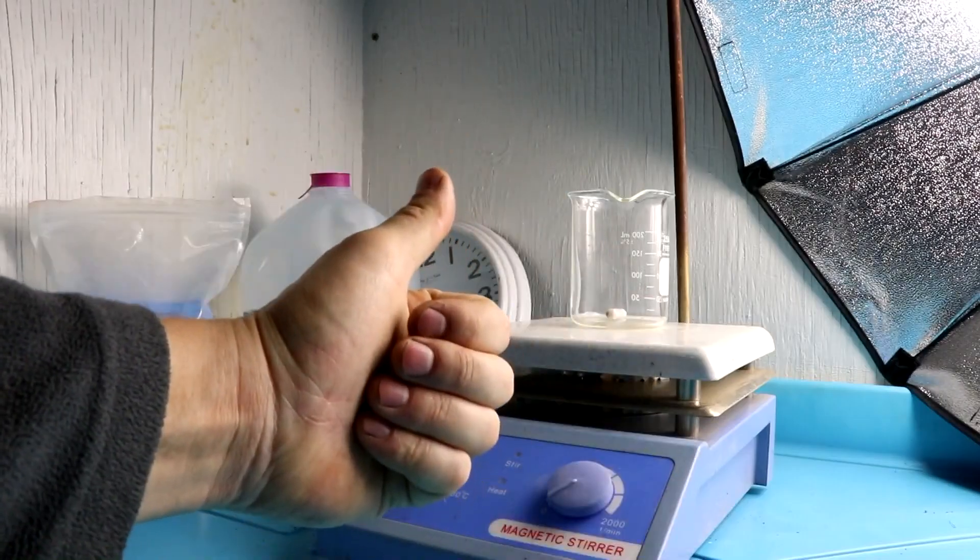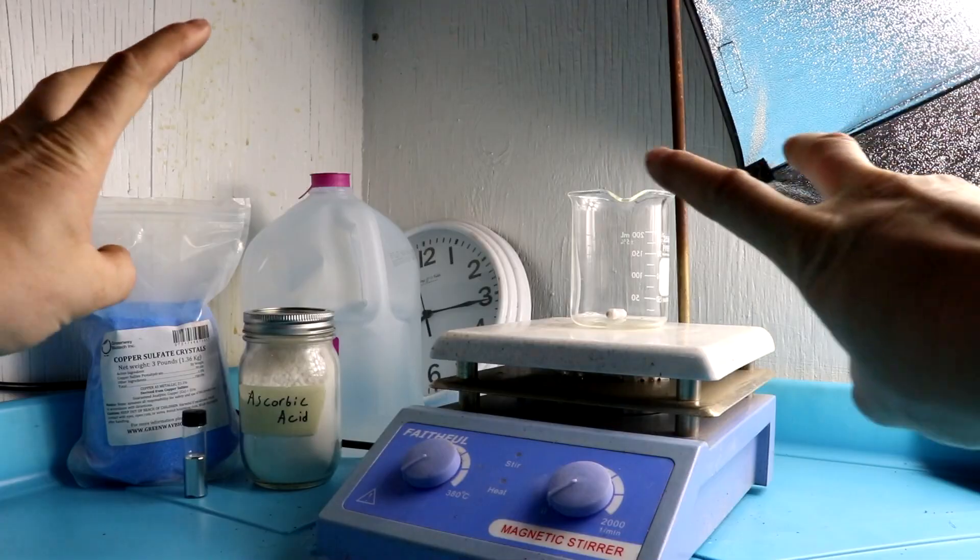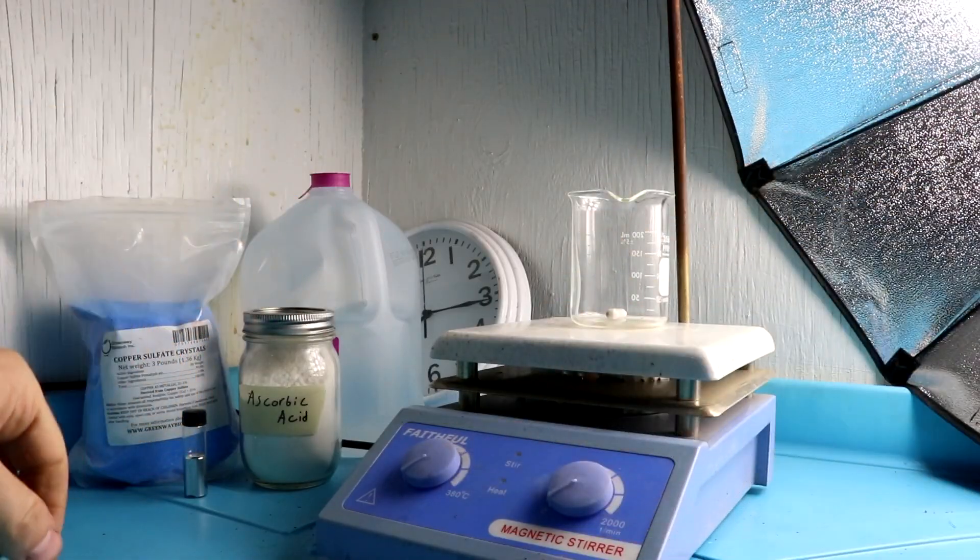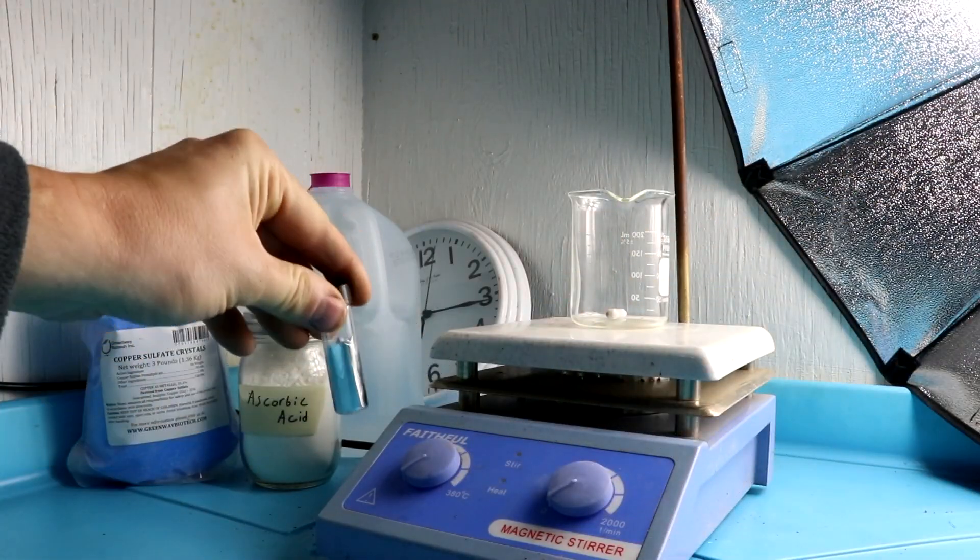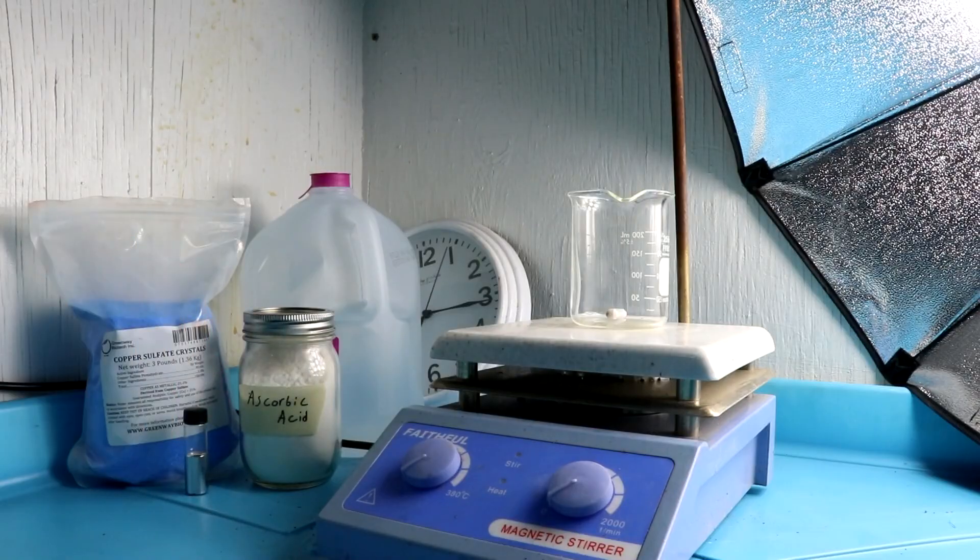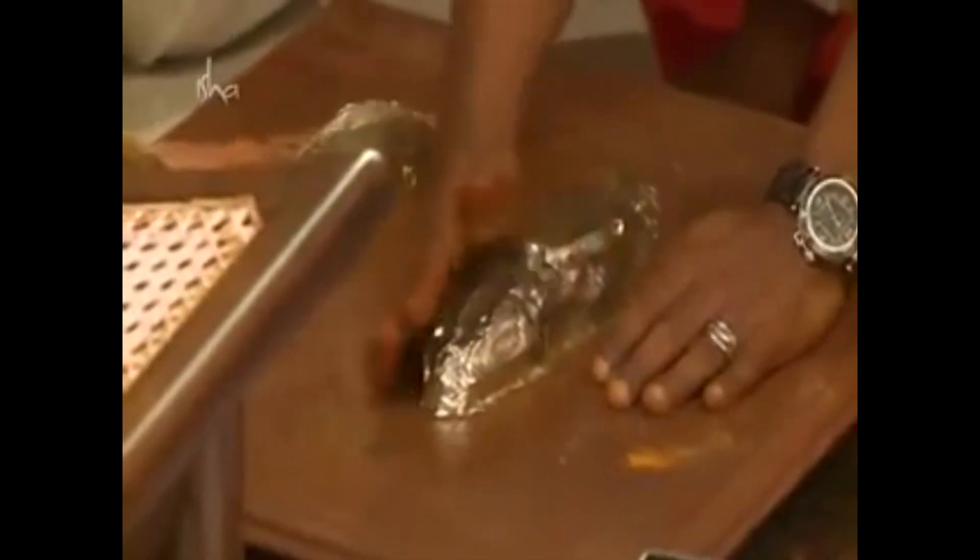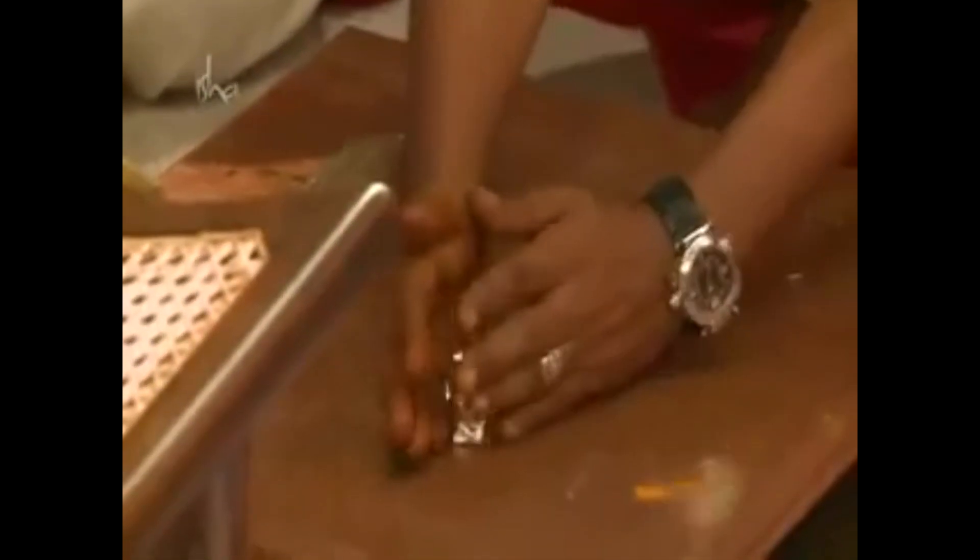Alright everyone, welcome back to Cody's Lab. So today I'll perform the miracle of turning liquid mercury into a solid at room temperature. So what you're witnessing is a miracle because according to modern chemistry you cannot solidify mercury. At room temperature it's just impossible to do it.